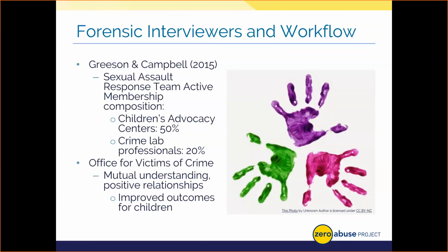You see, crime lab analysts can work with forensic interviewers to prioritize what evidence should be collected that might give the most meaningful results as it pertains to, say, DNA or body fluid analysis. The analysts, too, can help with identifying possible contaminants based on details such as evidence location or dialogue indicating that attempts might have been made, right, to clean up or destroy key items. Thus, you should really understand what tests and measures your crime lab can and can't perform so you can work effectively to streamline and quickly identify evidence from a child's interview and disclosure.